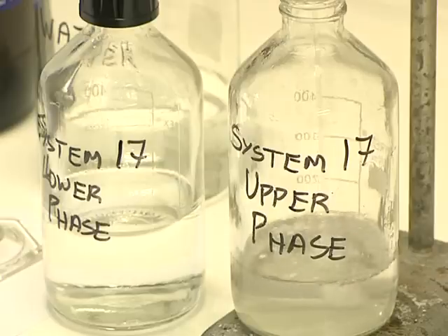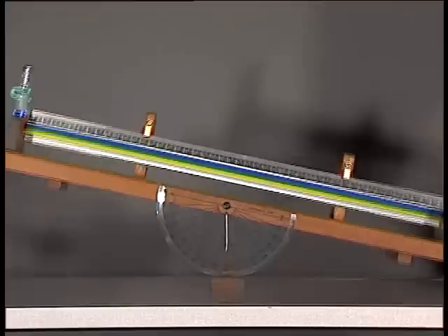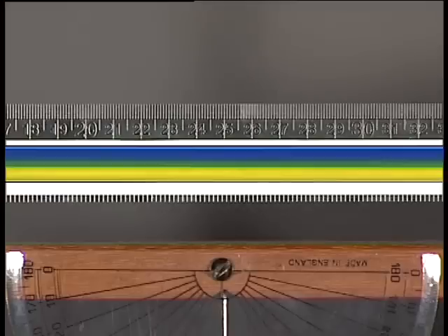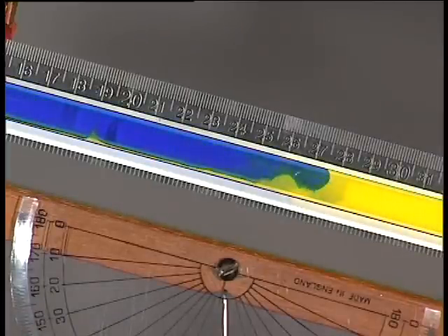When the coil is rotated with the two-phase solvent system inside, the planetary motion creates a mixing effect, akin to the swish-swash motion that occurs when a tube of two liquids is tilted from side to side. The net result of this motion is the formation of waves and a wave mixing effect.